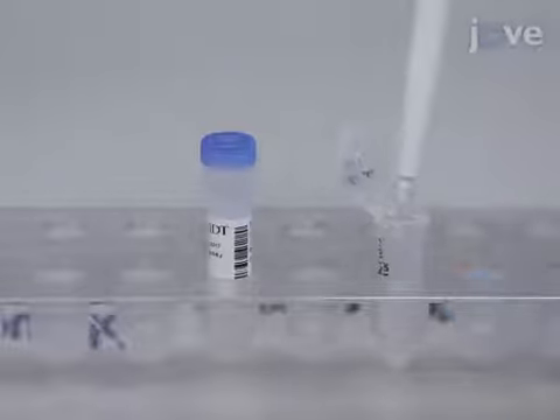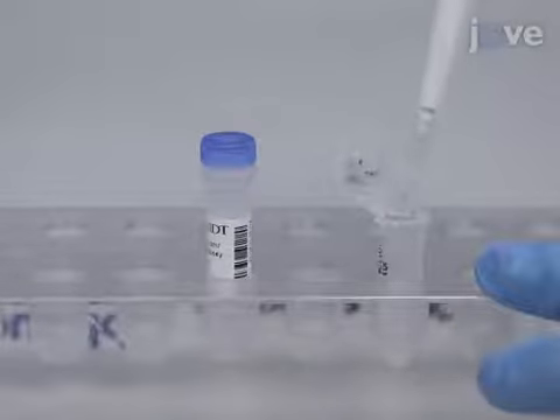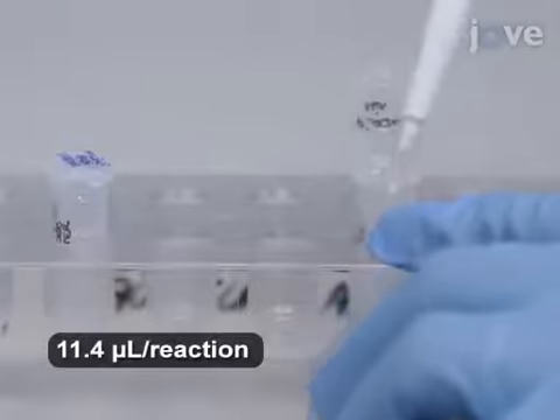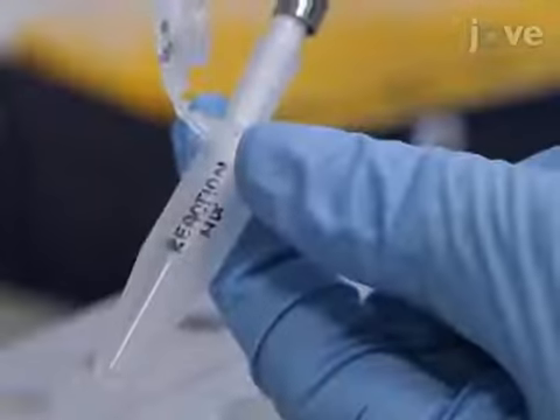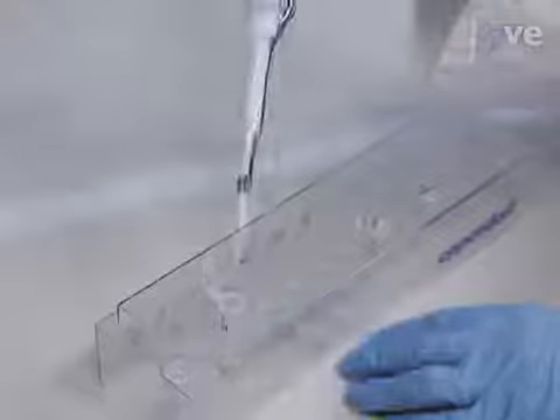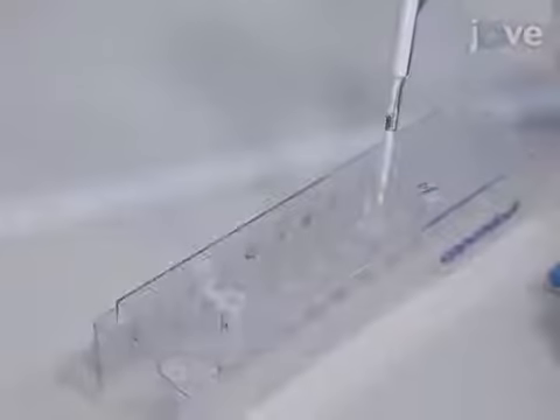Then, for each reaction, add 0.87 microliters of the custom assay primer and add 1.83 microliters of nuclease-free water. Mix the combination gently and transfer 11.4 microliters to each tube containing cDNA and to the no-template control.